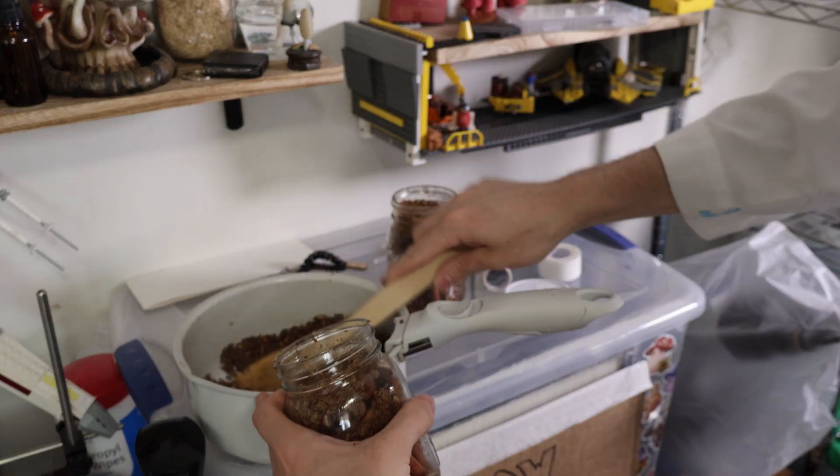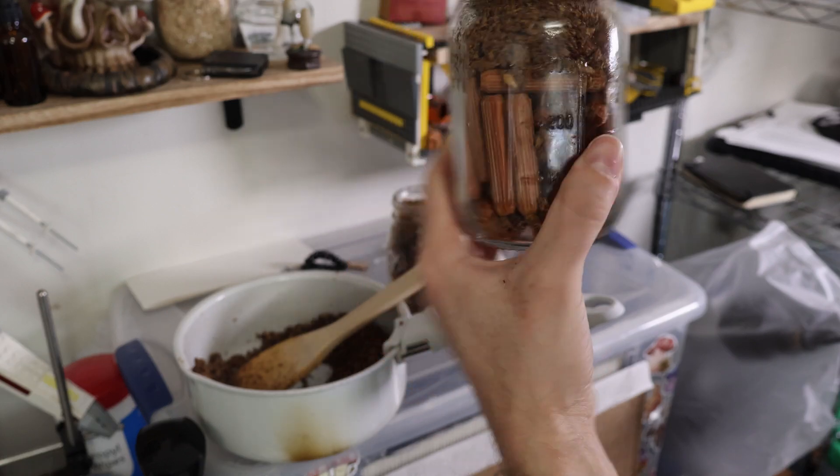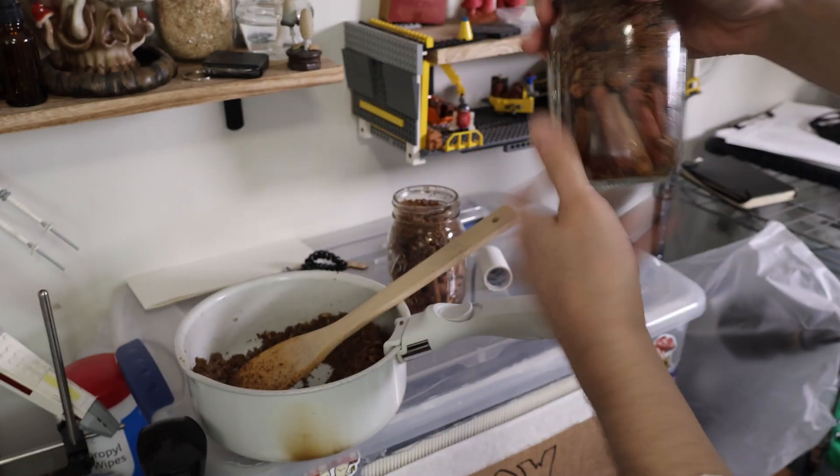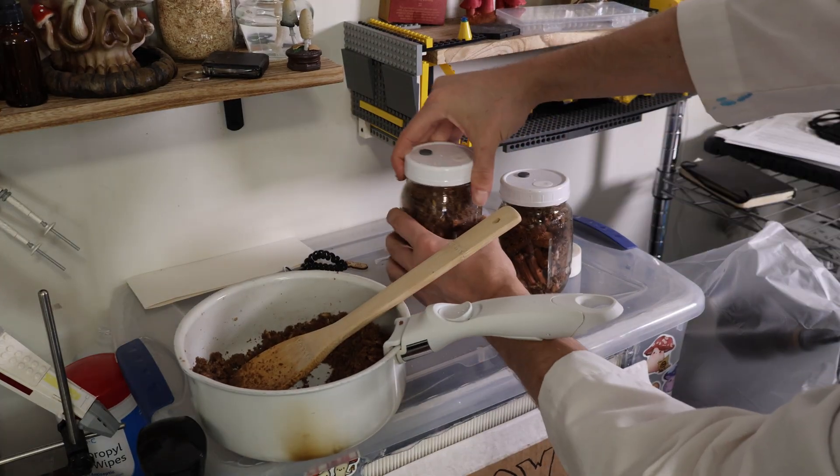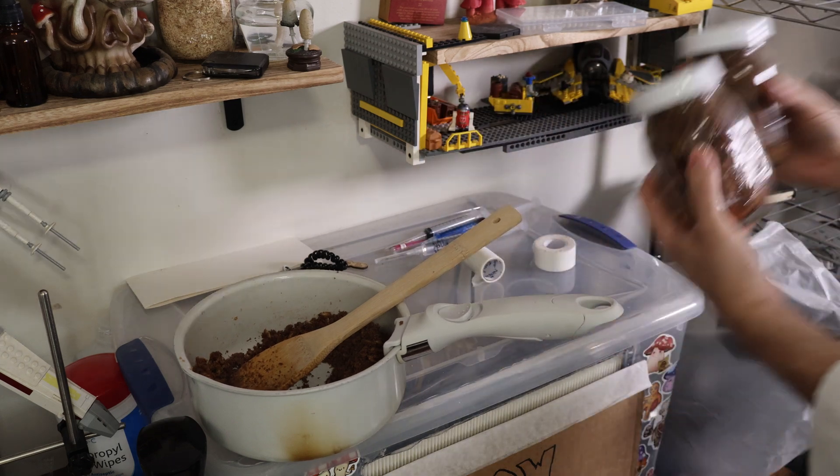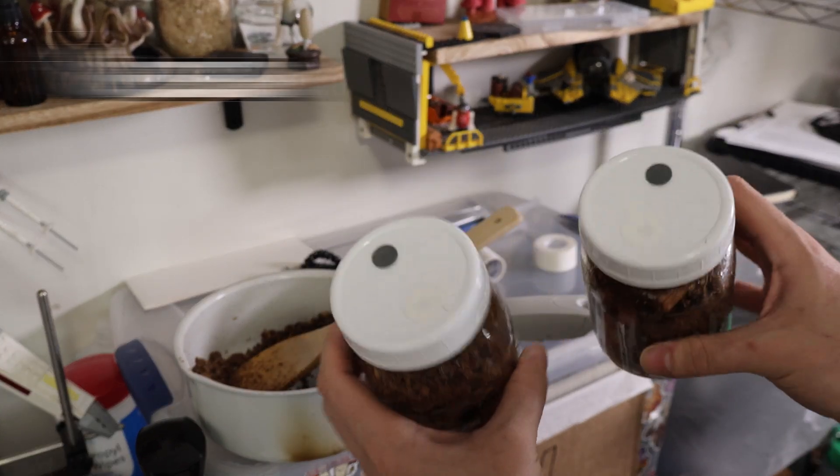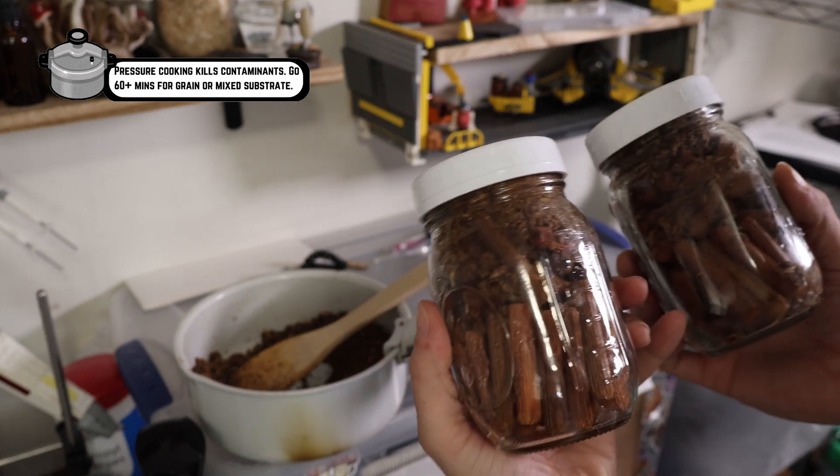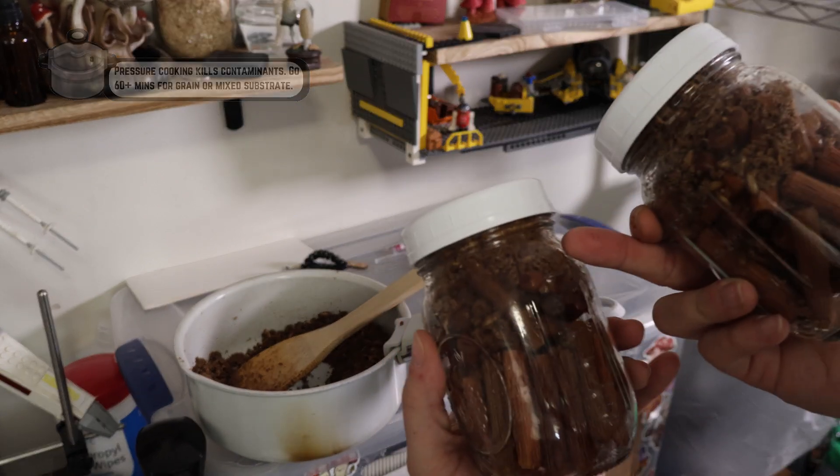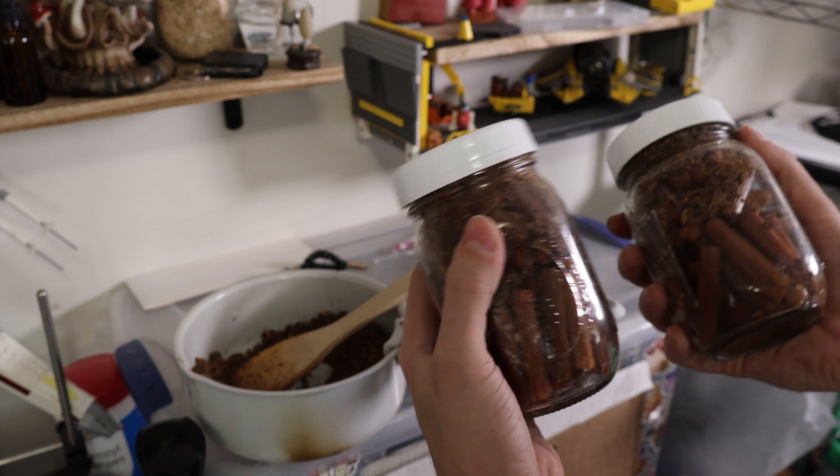Don't want to pack it down too tight. And that should be good for both of these jars. Throw a nice lid on. Now we can go cover these with aluminum foil and pressure cook. I'm going to send them probably for an hour just to be safe, just because of those oats that I have in the top. At least an hour.